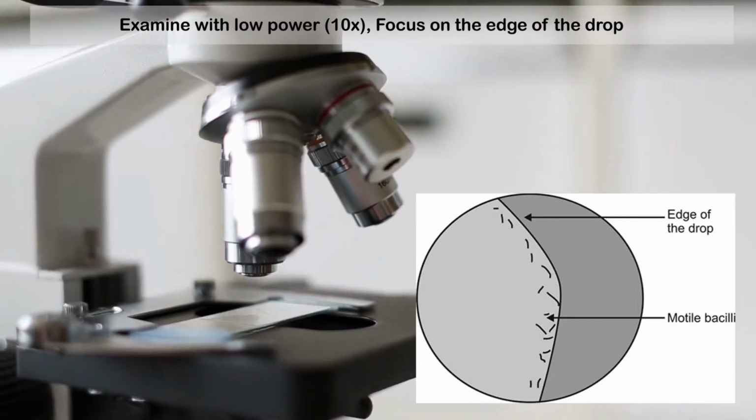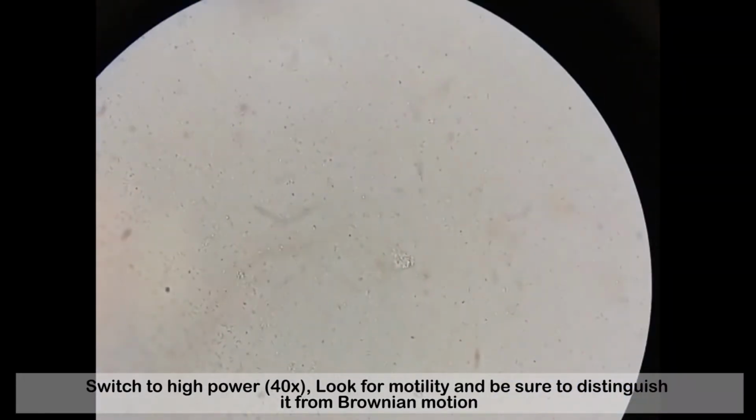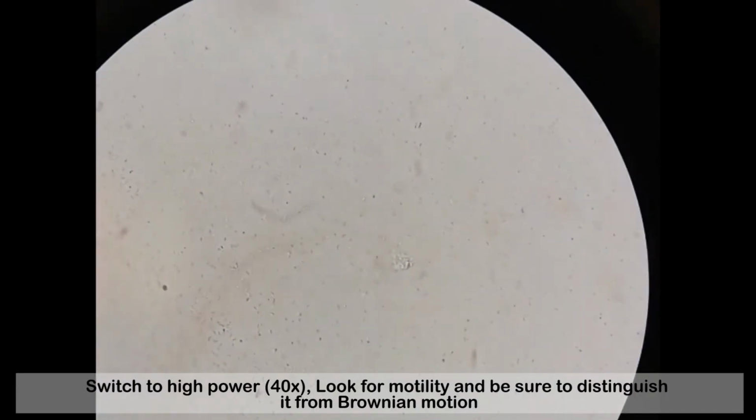Examine with low power. Focus on the edge of the drop. Switch to high power. Look for motility and be sure to distinguish it from Brownian motion.